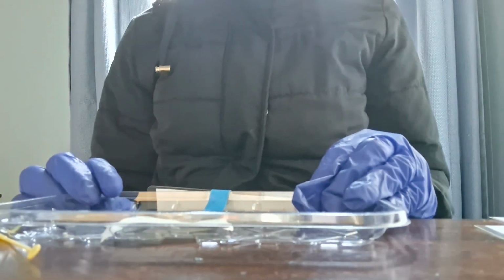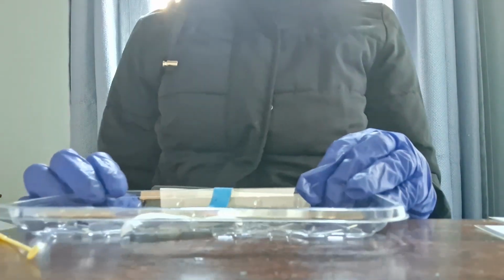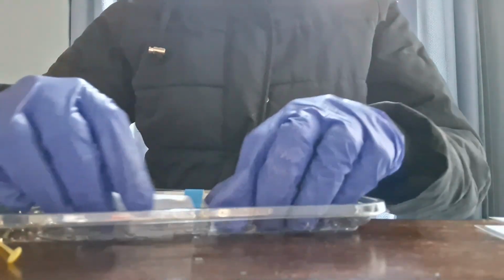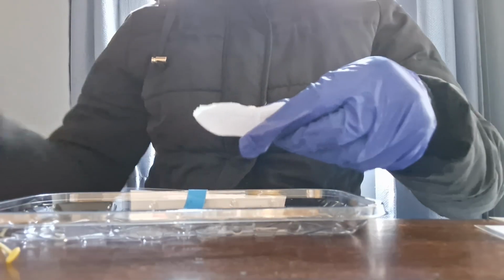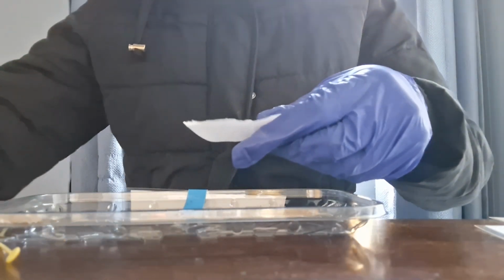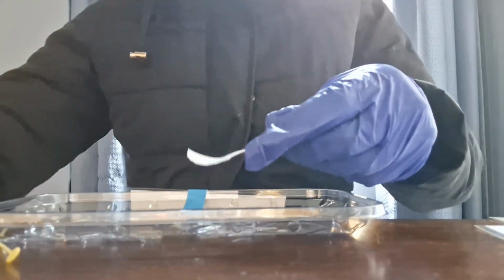So we have a staining tray, and this would be the blotting paper. So we put it on this.